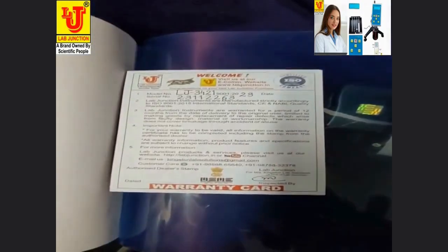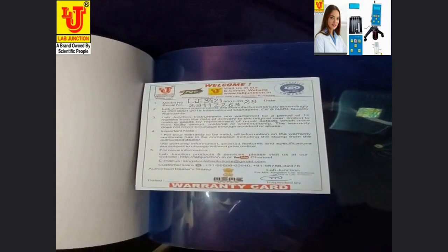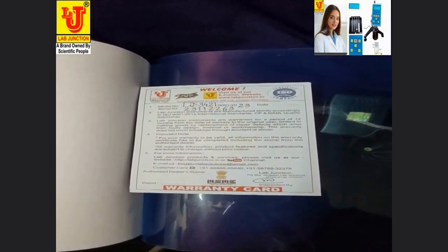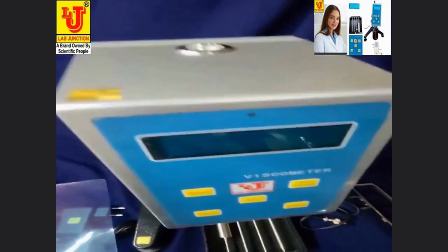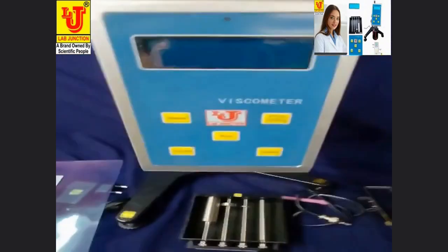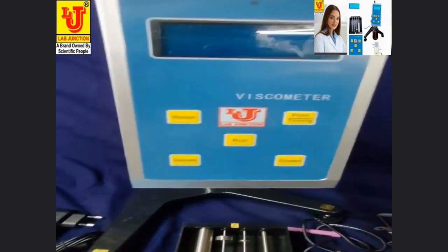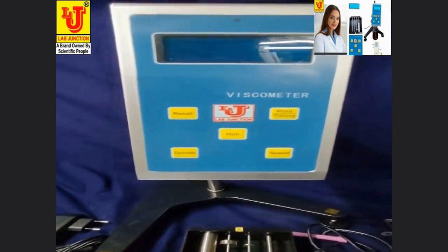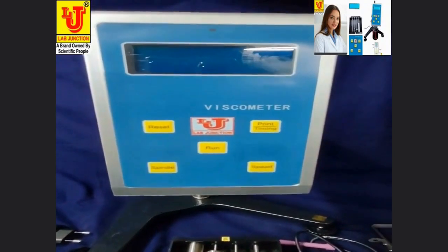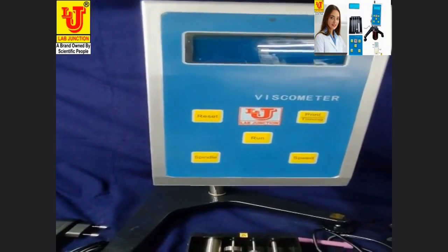This is the warranty card for one year. The viscosity meter has a digital display.